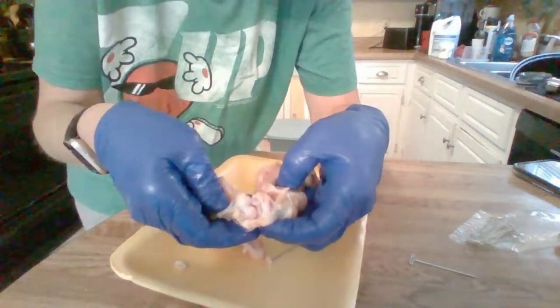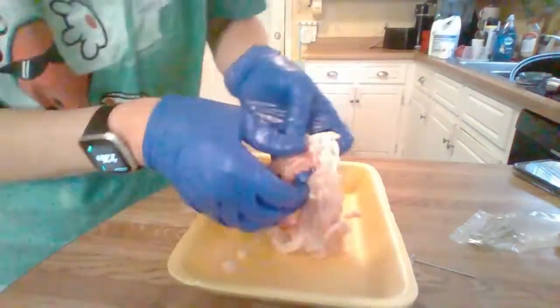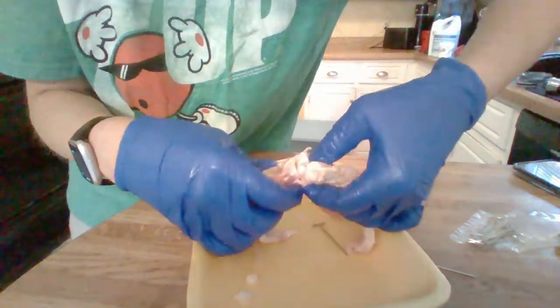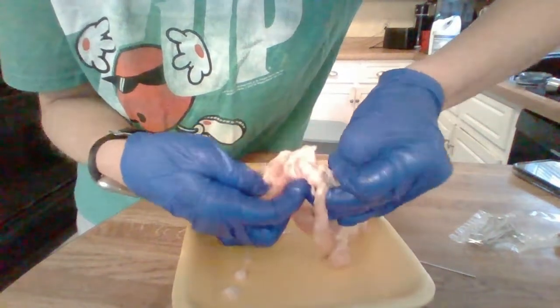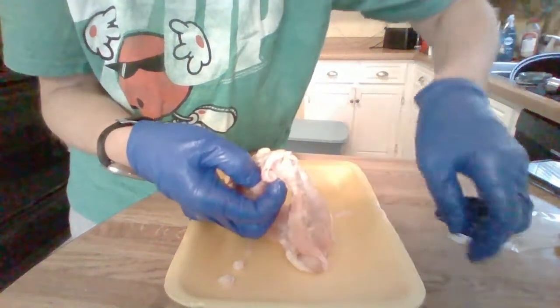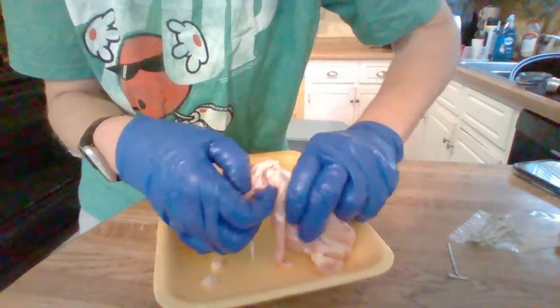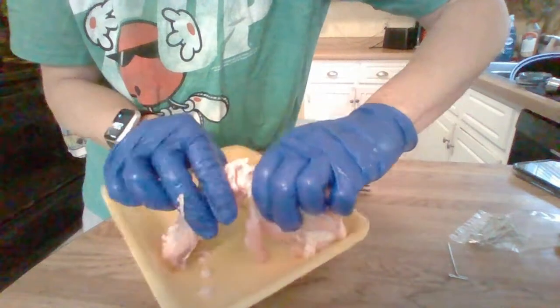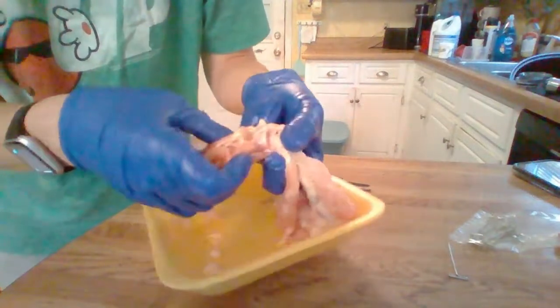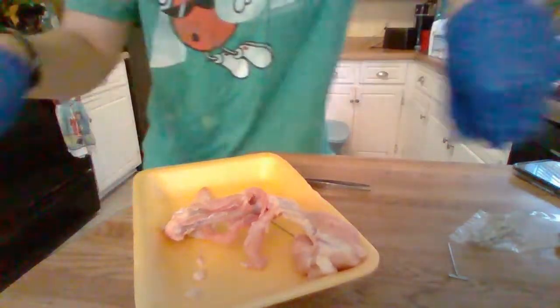And then the articular capsule is, I think you can see it best on this side, maybe over here. Here's the articular capsule, which just envelops. I guess you can see it right here too. Let me point. Here's the articular capsule. It just helps to envelop the different parts within that joint. There we go. Hopefully you can see that okay. So that is the synovial joint, and that is my rough beginning of trying to dissect.